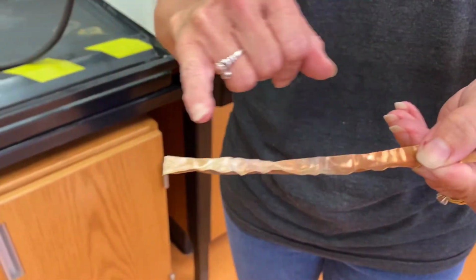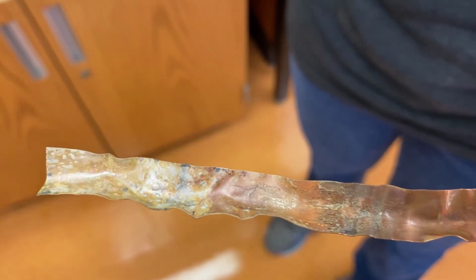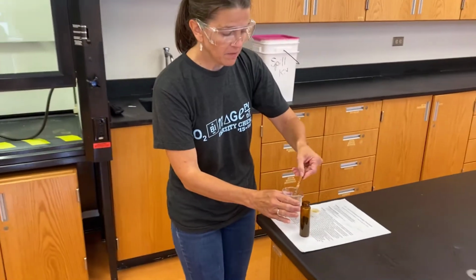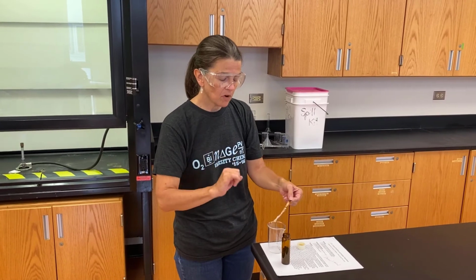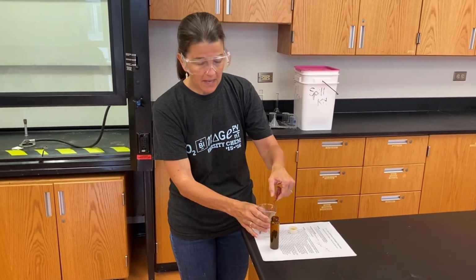See, all the solid iodine is gone, and there is a compound that's that creamy white color. That is an iodine compound with copper. Okay, now this would be put back in the beaker, massed again, and then it's still a little warm, so I don't want to do this. We'll scrape it off and mass it one more time.